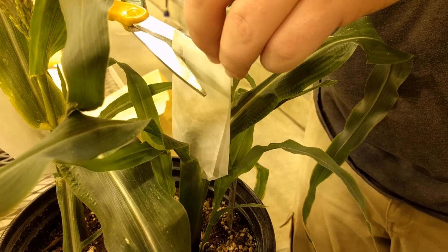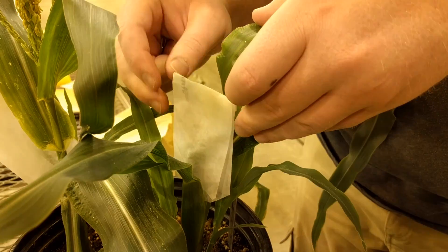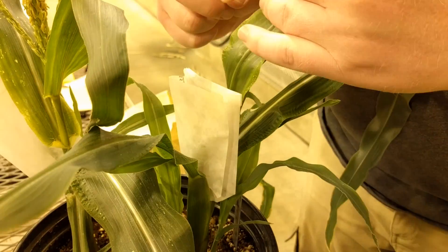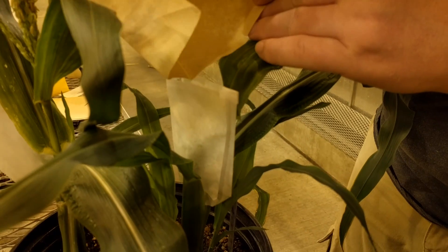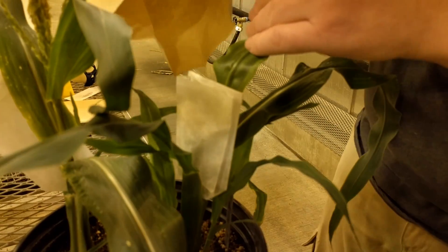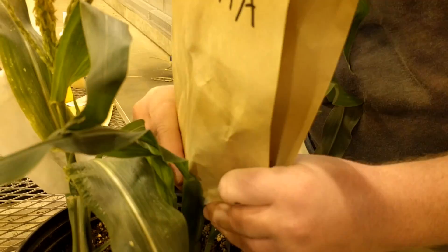Cut the tip off the earshoot bag and open it to gain access to the silks. Evenly apply pollen to the silks by tapping and moving the bag. When complete, cover the ear with a tassel bag and staple it around the plant.